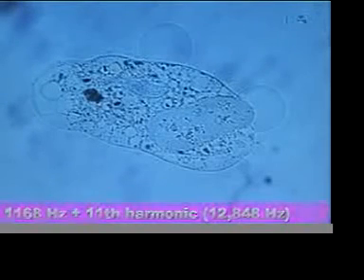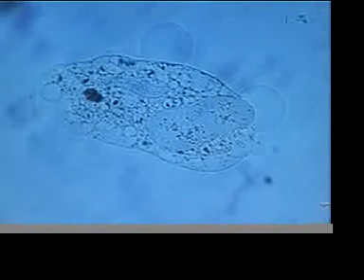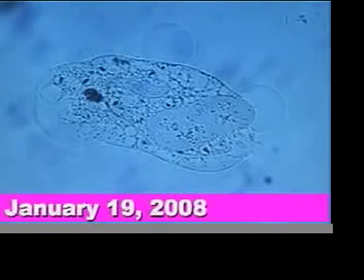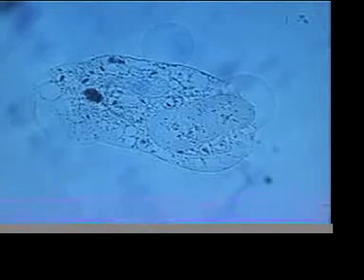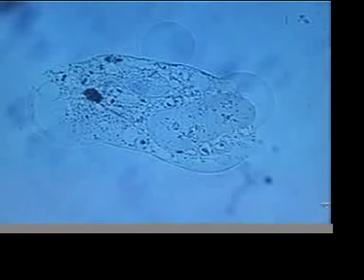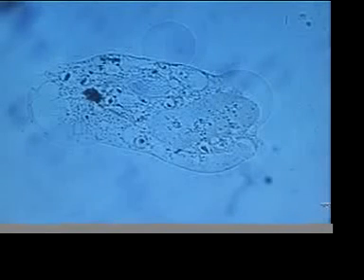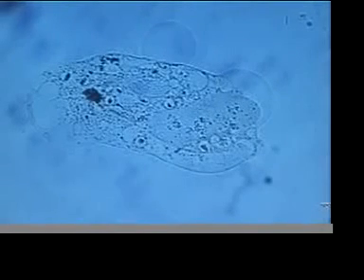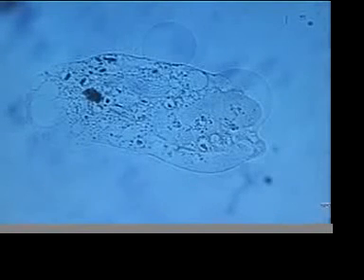12,848. Today is January 19th, 2008. This is about 110 watts, SWR 1.18. This is a Rife-Bare plasma experiment, and the plasma device is about 6 inches away from the microscope slide. We continue to see degradation in the organism.